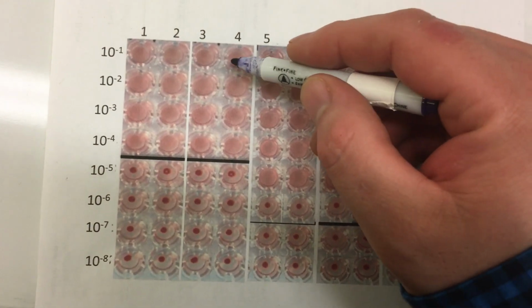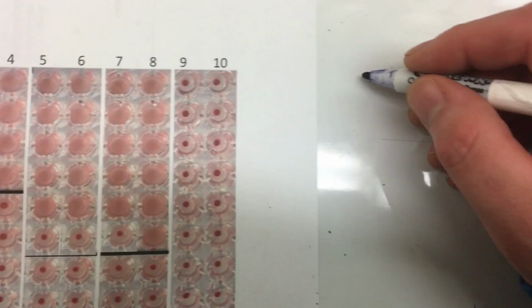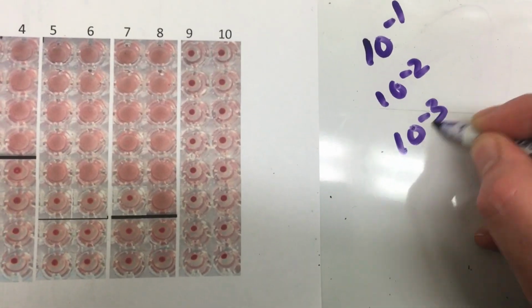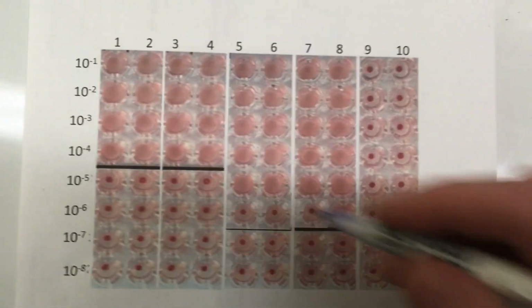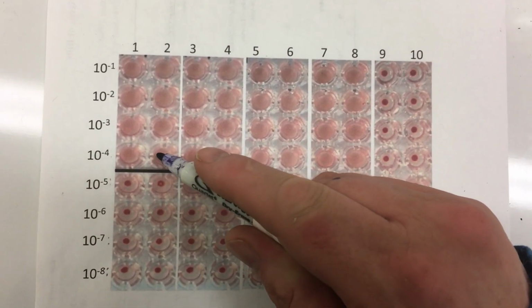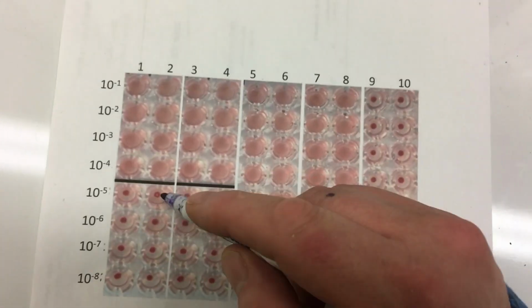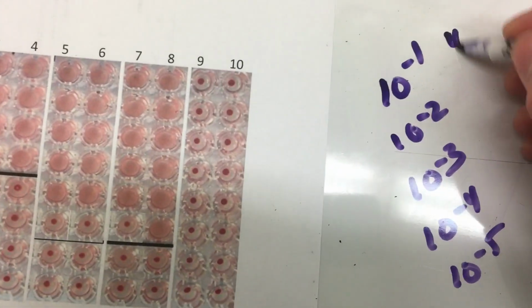The first thing we have to do is calculate how many of these individual dilutions are infected. For this first sample, we have 10 to the negative 1, 10 to the negative 2, 10 to the negative 3, 10 to the negative 4, and 10 to the negative 5. We can see that the virus stops between 10 to the negative 4 and 10 to the negative 5. So we need to calculate the percentage of wells that are infected. For the first, we have 4 out of 4.